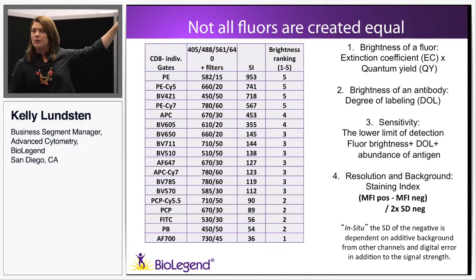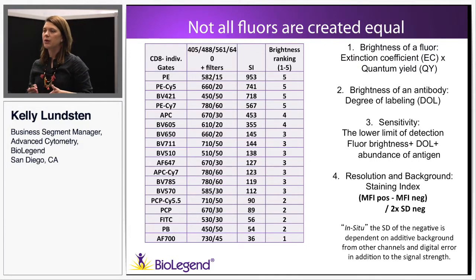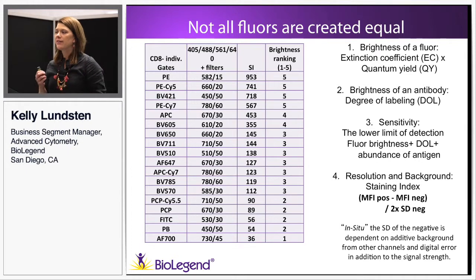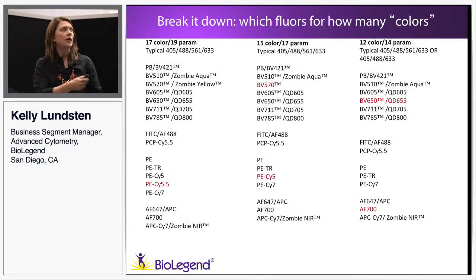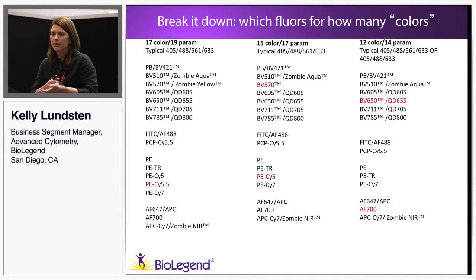But you still have to use all the tools that you have. When I look at something like this, I pull out my favorite fluorophores, things like PE, BV421, Alexa 647, Alexa Fluor 488, and I hold them back from assigning them initially to my primary tier antigens, because they're going to be the things that I want to put on my most special and most important antigens.